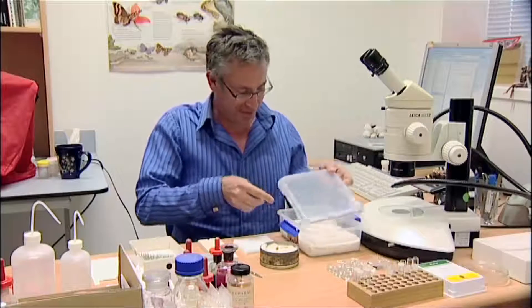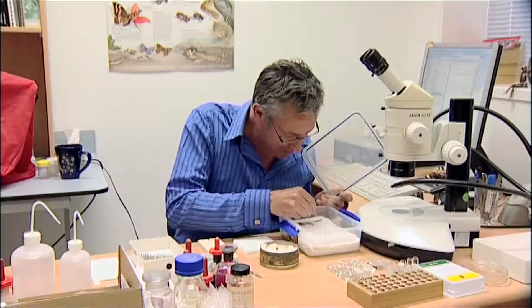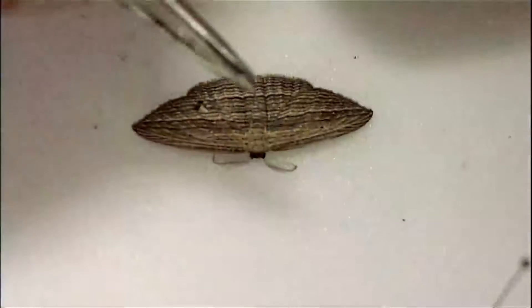I'm just going to take my moth out of the relaxing box. This is just an ordinary lunch box with some moistened tissue paper on the bottom, and this keeps the moth nice and floppy so that you can move the wings into position.